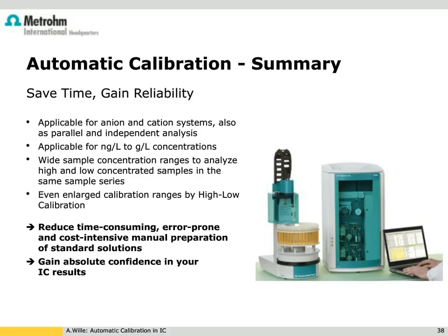The first question came in earlier today, and it's to Liz. If my lab can only afford one ion chromatograph, what would you recommend as the most versatile detector of the ones you've discussed? Okay. Well, after talking about mass spec, I think really the cheaper option is to use something less specific. So probably a conductivity detector is the cheapest and easiest one to look at a whole range of analytes.